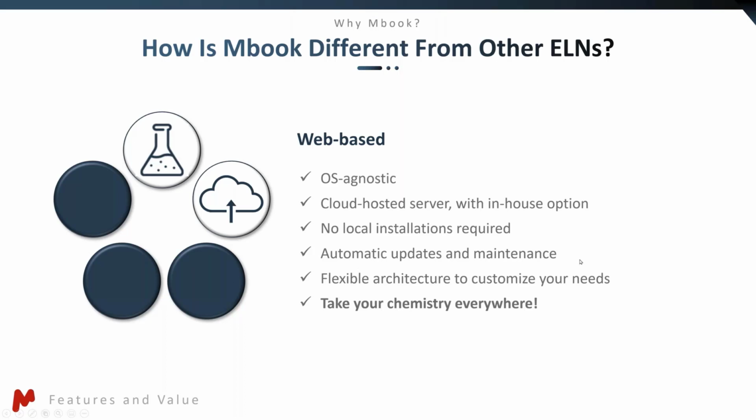The maintenance and updates are done automatically. And the architecture, as I will demonstrate, is really flexible, so you can use it the way you need for your workflow. And also you can take your chemistry everywhere, which means that you are not fixed to the connection in your lab, but you can do it, for example, at a conference, when it will be allowed once again.